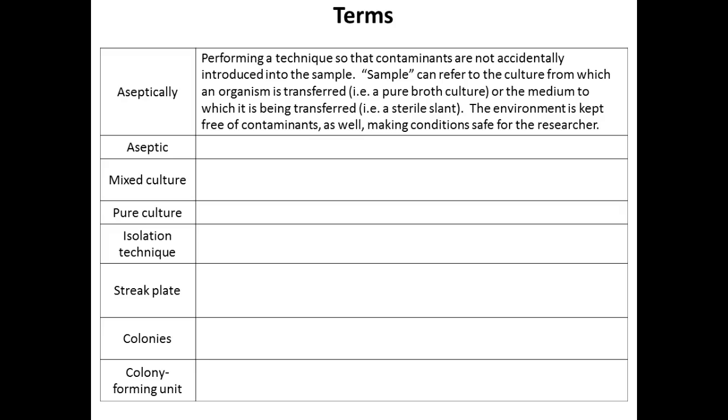So we want to make sure to keep these cultures pure. And so aseptic is just an adjective. It describes a condition of being without contamination.